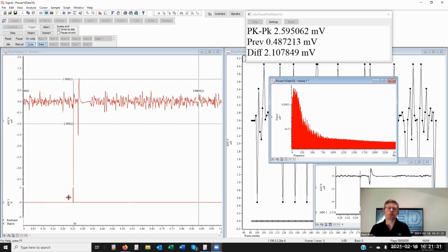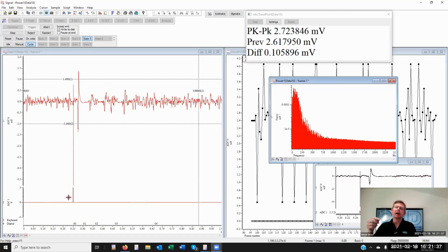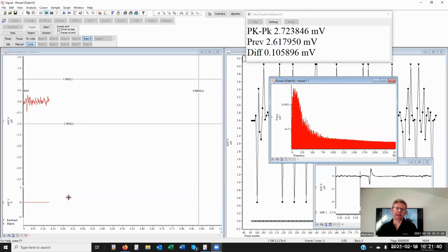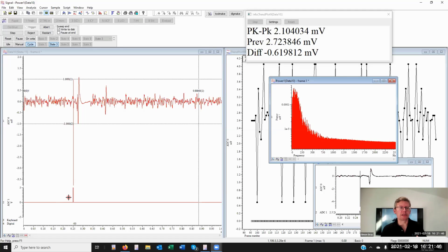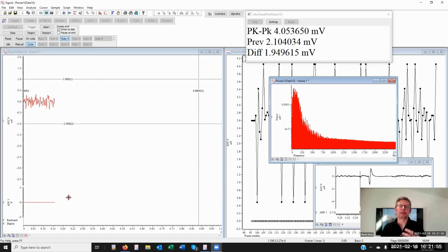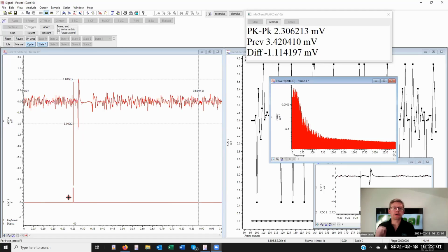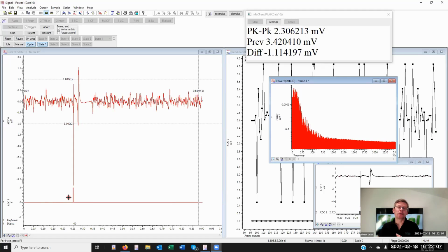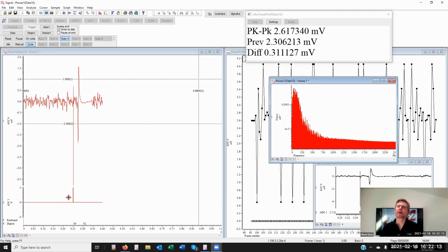So that's where I'm sending out a digital pulse, which will go off to a magnetic stimulator, an electrical stimulator. I've simply rerouted that background to the ADC. So I'm digitizing the pulse that's gone out, which is a waste in terms of number of data points we're saving into a file. That is, it's a waste if we can replace it with something that's better. That digital marker is better in terms of timing. The markers could be placed at the beginning and end of the pulse as well if you wanted to know duration. It also makes it much easier in one's mind's eye for an active cursor to find data points.